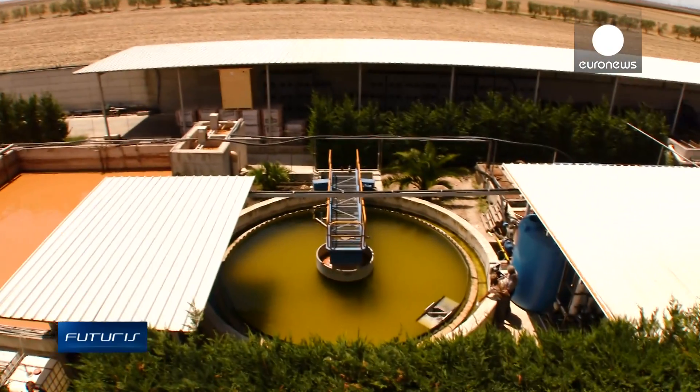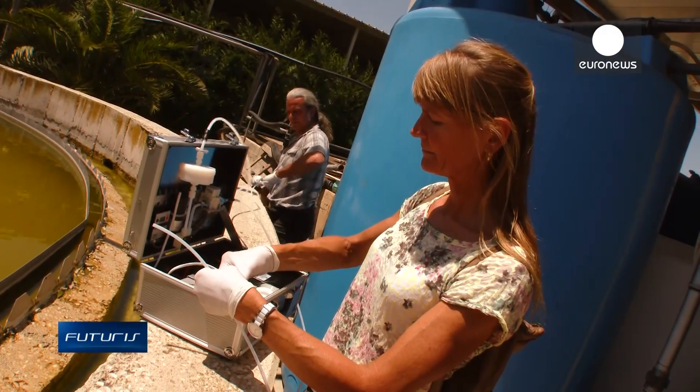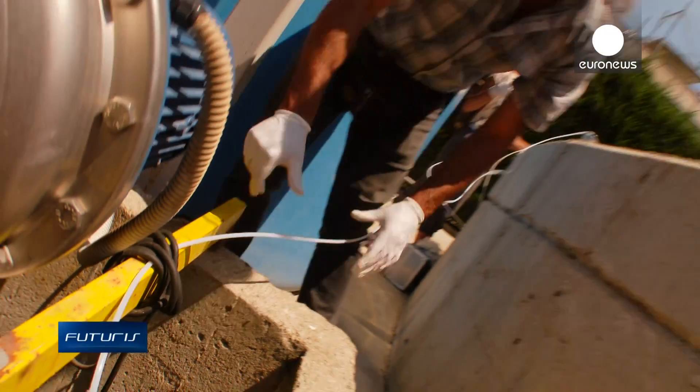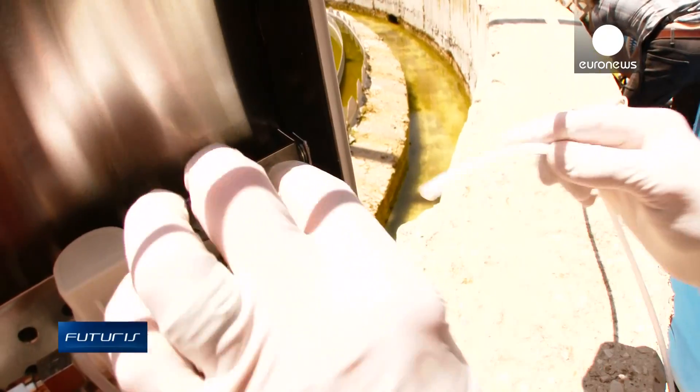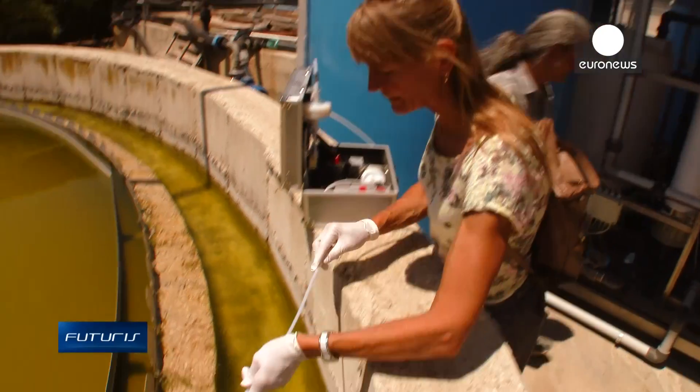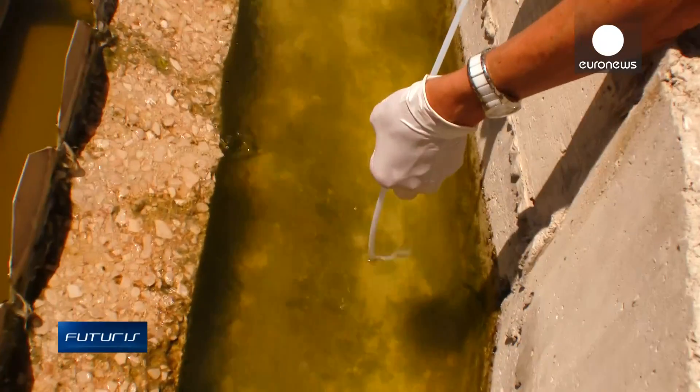Scientists working on the European Commission's Joint Research Centre have come up with a kit that simplifies the inspection. Instead of sending recycled water to the lab, they pump it through a filter using a specially designed portable box. The chemicals are trapped and preserved for lab analysis.